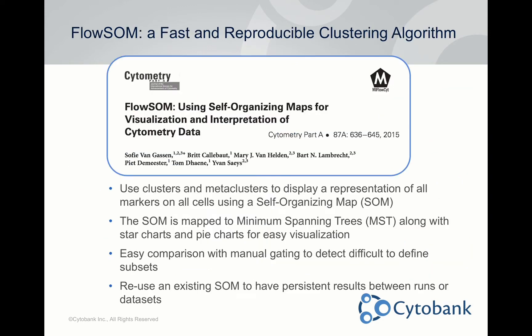Today we're focused on FlowSOM. If you haven't read the paper, I'd recommend it — it describes how FlowSOM works. FlowSOM is a clustering algorithm similar in principle to SPADE, but with key differences. It uses self-organizing maps, which gives you a reproducible way to map the same cells to the same locations on your tree. You can also set a seed, which I'll explain shortly, making analyses very reproducible.